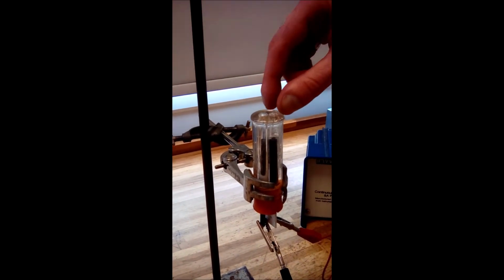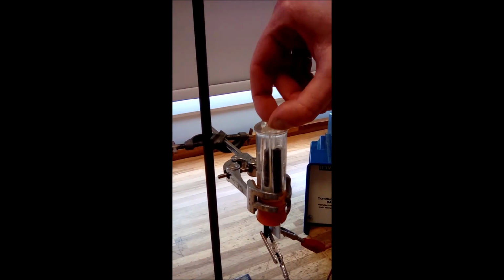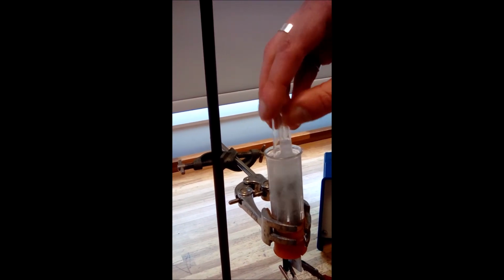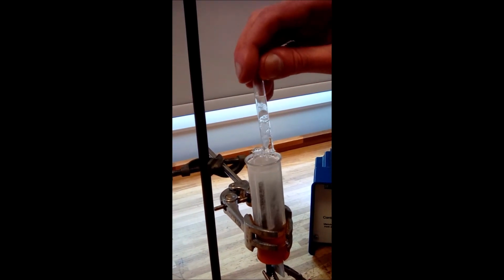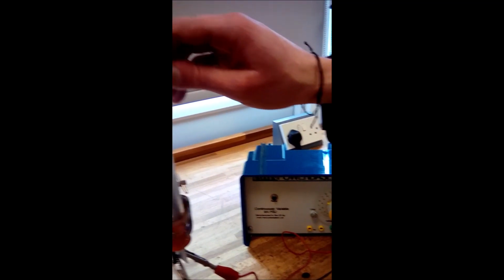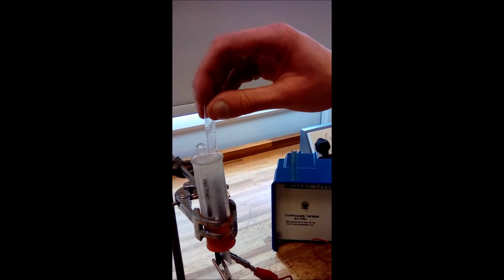I'm going to just pull it out and then check to see my chlorine gas. And there you go, as you see, it goes clear with the presence of chlorine gas, proving that we were separating the chlorine into this test tube there.